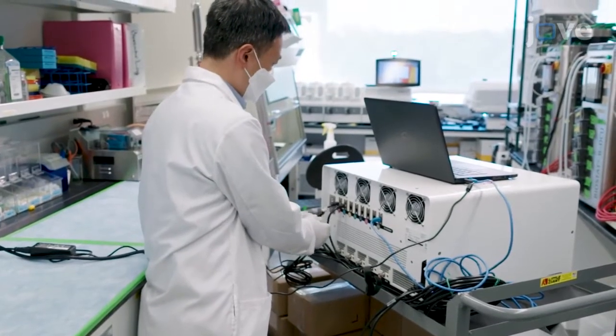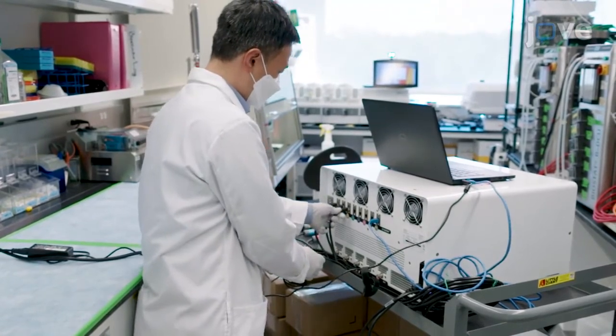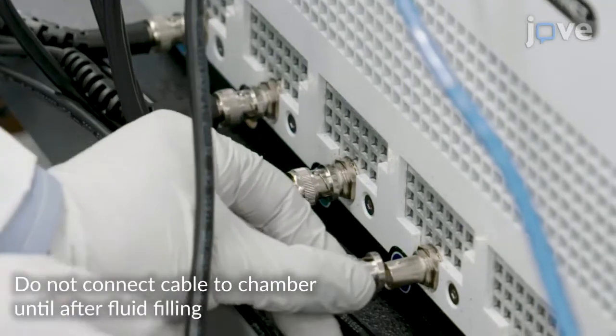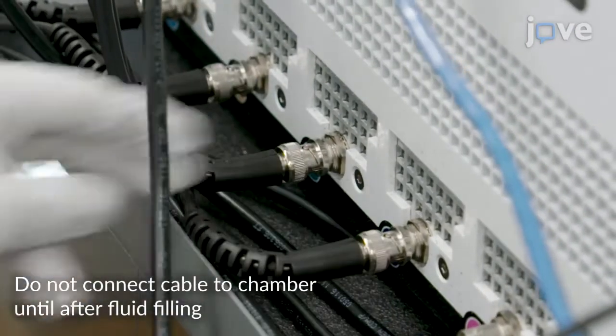To prepare the acoustic wave separator, connect the turbidity cables to their respective ports and connect the chamber power BNC cables to the back of the acoustic wave separator system.